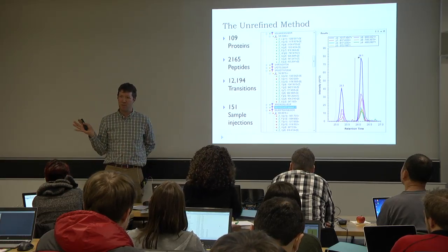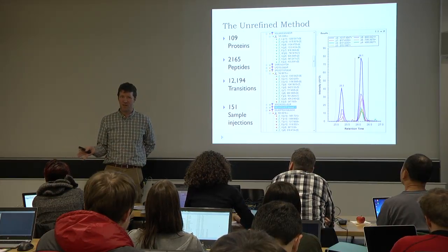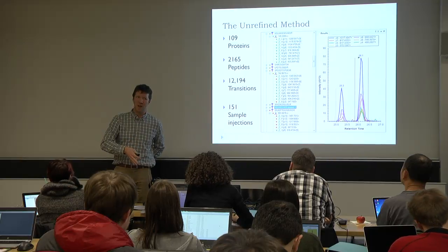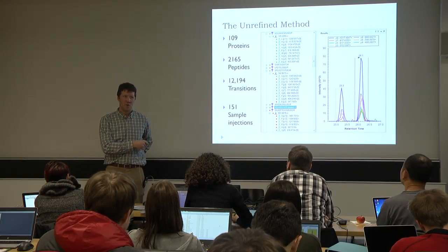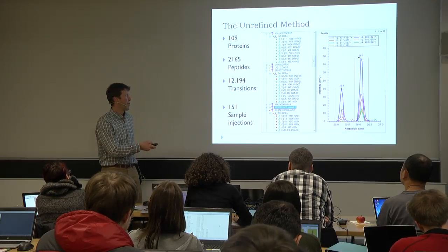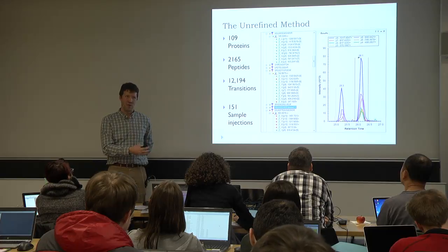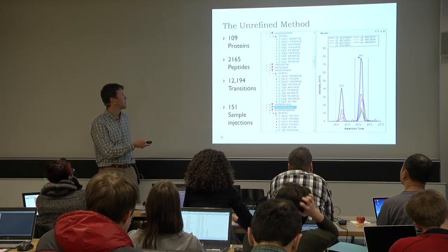We don't have spectral data. We haven't ordered synthetics, because we didn't order them. If we ordered synthetics, we could create a spectral library from the synthetics, but we didn't. We just said, okay, with a relatively simple sample prep, what do we think that we could see if we used a triple quadrupole, our most sensitive instrument at the time?